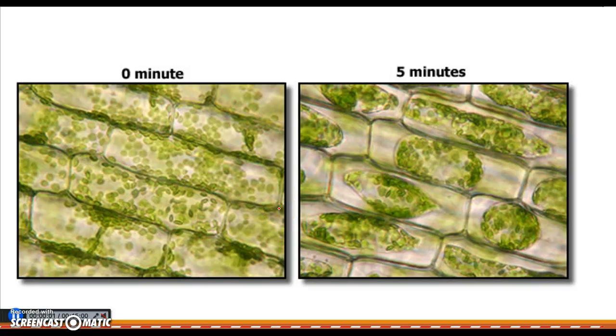Hey guys, I wanted to pick up where we left off in class to make sure we got through everything. And let's take a look at what you should have seen in the microscope. This was just supposed to be the fresh water, okay?